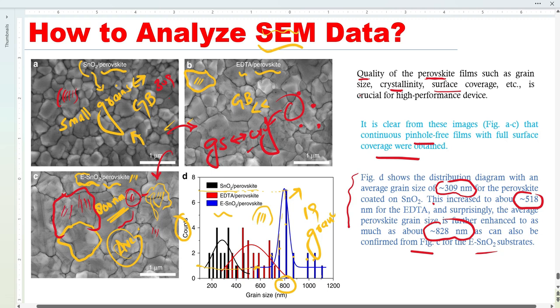You can roughly say what will be the size. If you take this one micron scale, one micron means 1000 nanometers, just take this one and measure this grain. This is almost... yeah, it works.